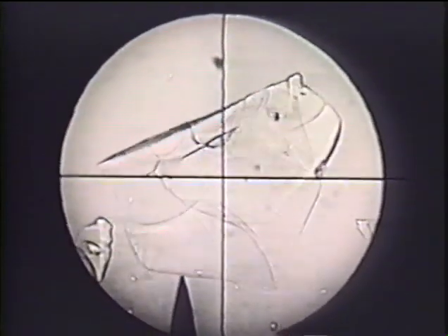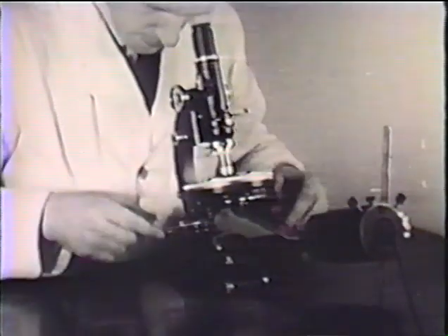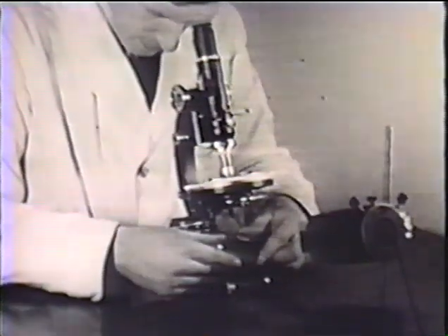If the objective is raised a little the line moves onto whatever material has the higher index. Here it's on the oil. When the objective is lowered the Becky line crosses the margin of the grain and appears on the material of lower index. The oil is therefore of higher index than the grain.